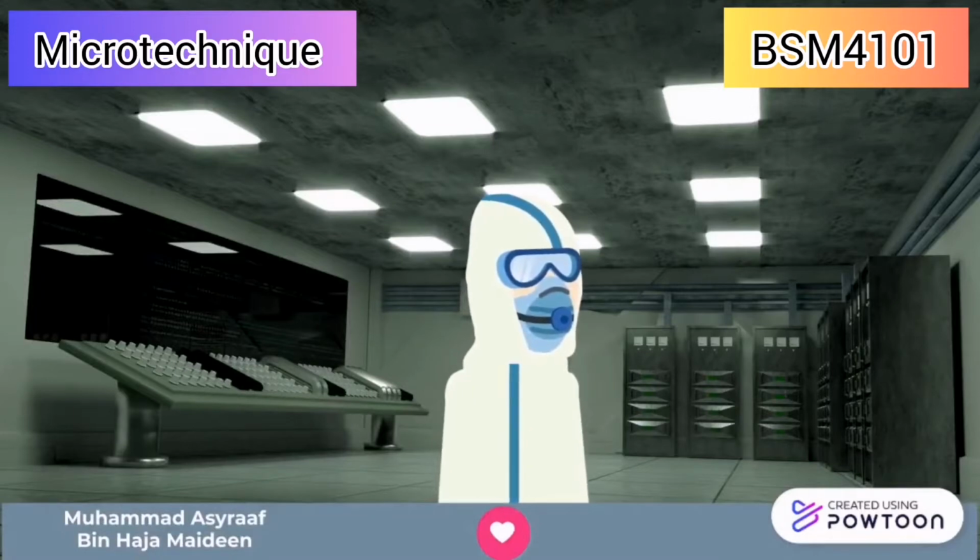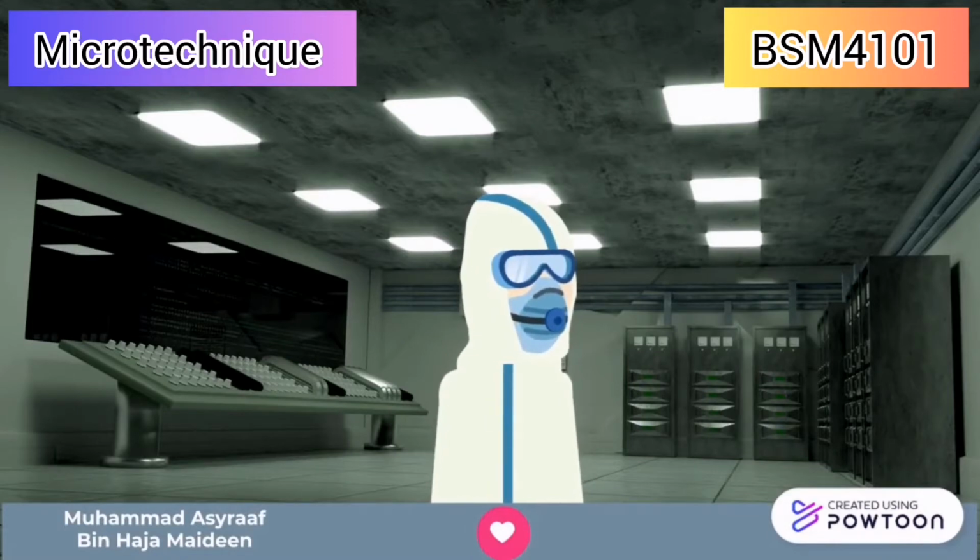So as mentioned by Dr. Yaya last week, today we're going to do a histological analysis for our microtechnique subject. Have you guys prepared your hibiscus? If yes, then let's begin.